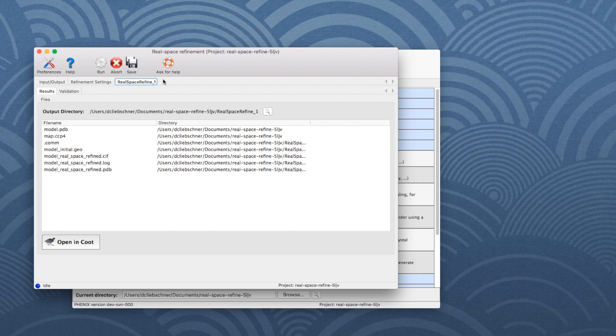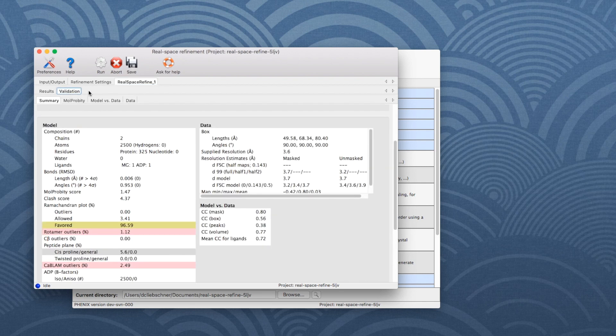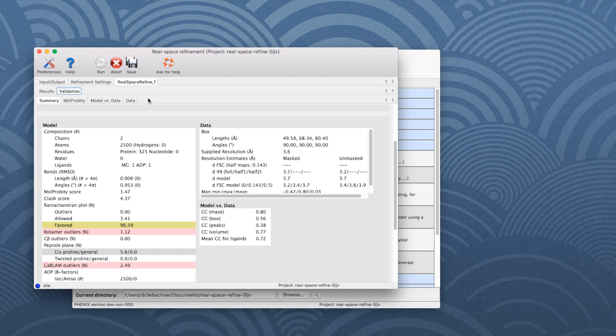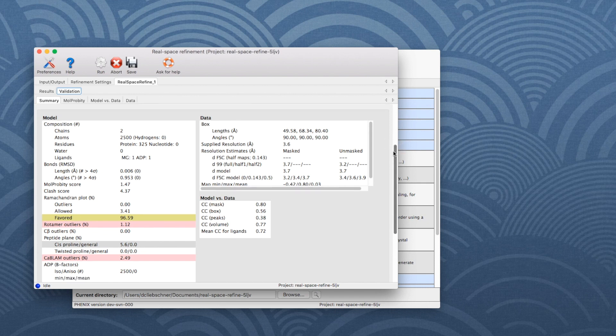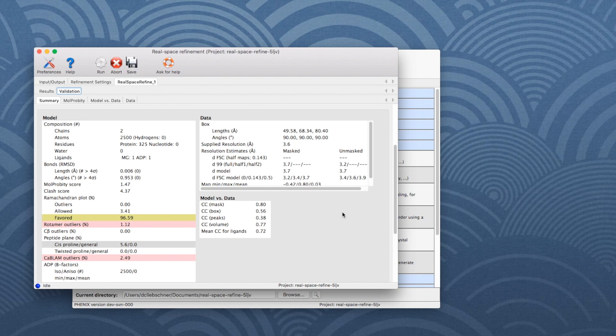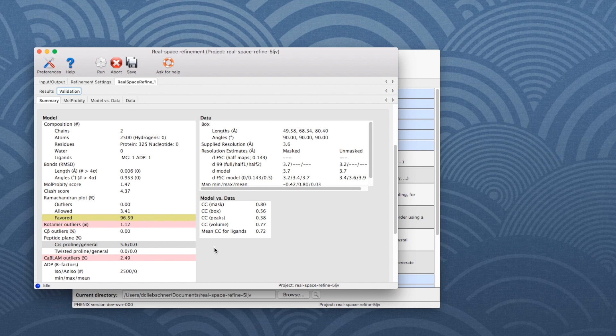The Validation tab shows validation results. It has several sub-tabs. The Summary sub-tab gives a quick overview of data, model, and model versus data quality. Red and yellow highlighted values indicate warnings and problems, so it is recommended to have a closer look.